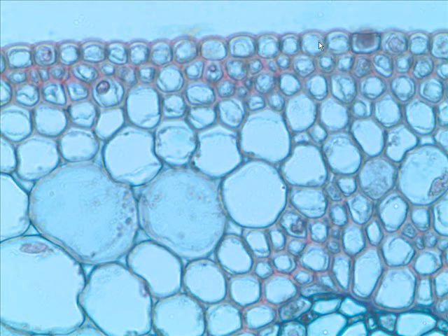The outside layer, we're always going to call that epidermis when we're talking about primary growth. But just inside the epidermis here, there are thick-walled cells. And we said that's what kind of tissue? Sclerenchyma tissue. It provides a little bit of stoutness for this corn stem. Not all monocot stems have sclerenchyma there, but corn stems do. It gives the corn stem just a little bit of solidity to the outside.